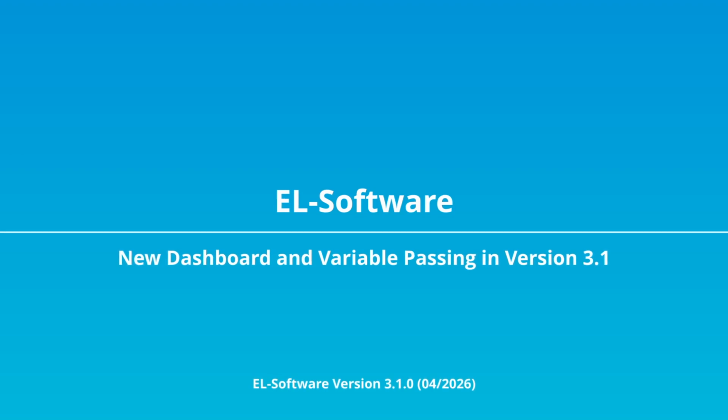In this video, I'd like to introduce the key new features of version 3.1. So let's get started.